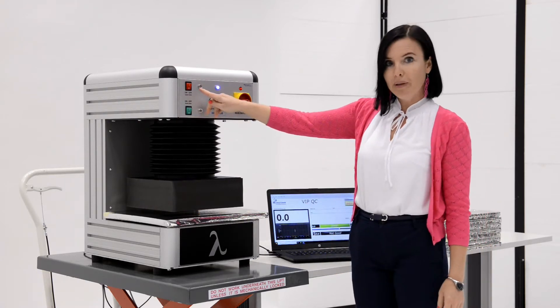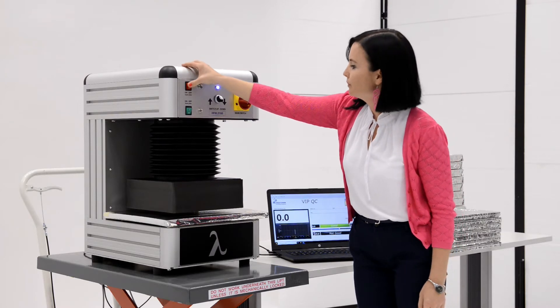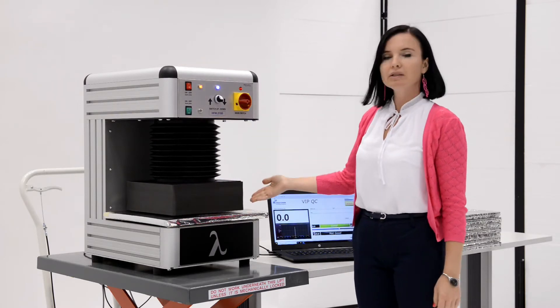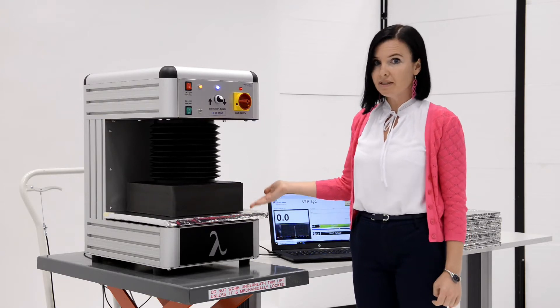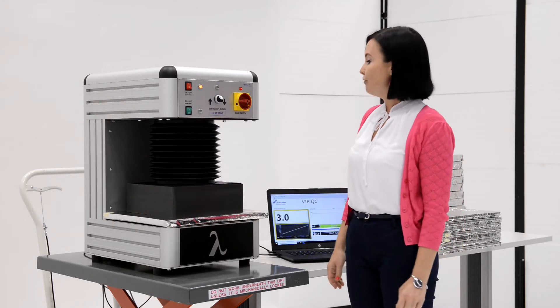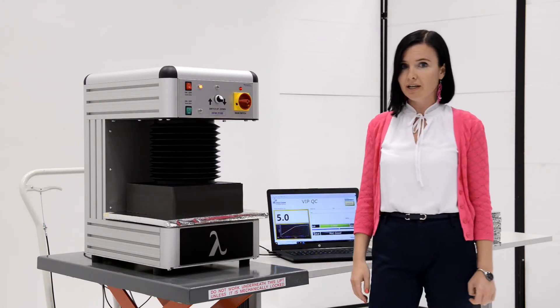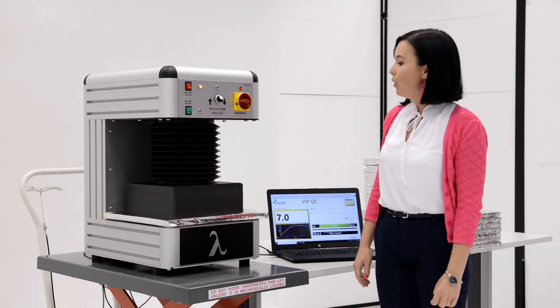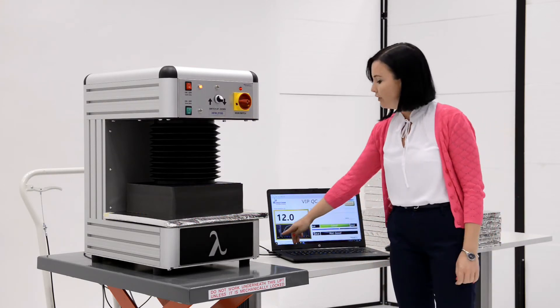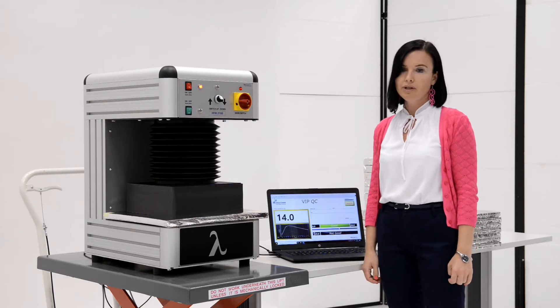Switch on the upper plate only. The plate will stop automatically when it settles on the sample. You will need some time for the plate to reach the target temperature. When it reaches the target temperature, the signal light in the program window will turn green.